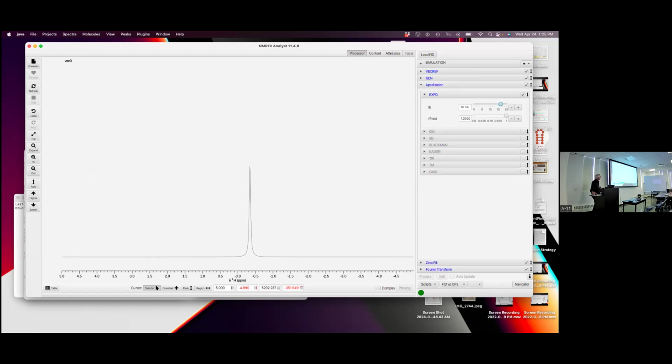But you'll note that the signal is getting lower and wider. The width of the signal is basically related to the rate at which it decays, and so by adding more exponential decay, I'm actually widening the signal. Let's go back and look at the Kaiser. Let's just turn Kaiser on, so Kaiser on and off. Lower down that intensity there. So turn on Kaiser and compare that with exponential decay.